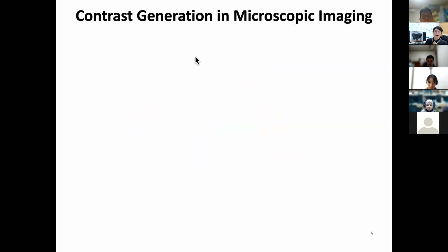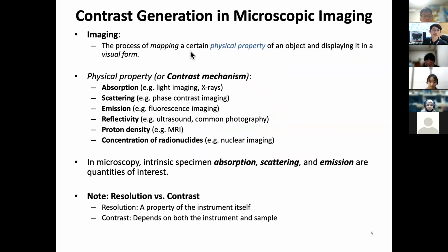So now, I want to discuss contrast generation in microscopic imaging. Let's get back to the question of, again, what is imaging? This course is about biomedical optical imaging.